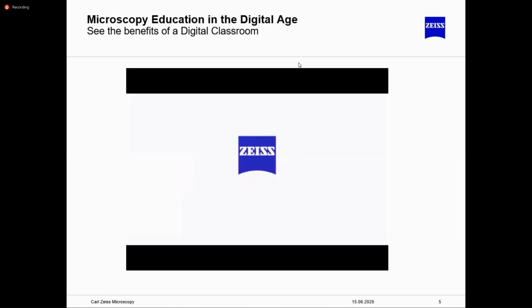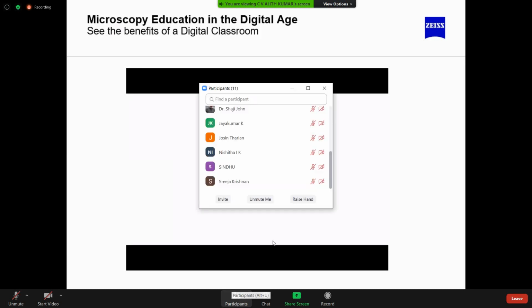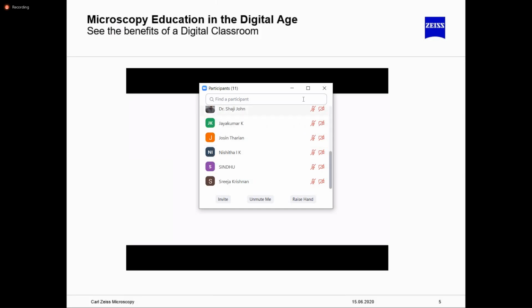With that video, I hope that video was clear to all of you. With that video, we have seen how important interactive discussion in a classroom with fun is. And the teacher is able to see all the microscopic images together in his tab and project it and lead the discussions in the classroom well. I'll go to the next slide.